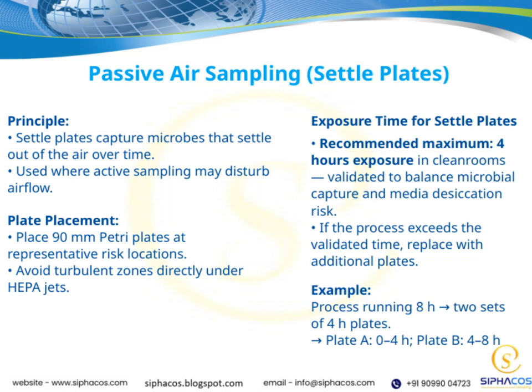Now, moving on to passive air sampling using settle plates. This method relies on the principle that microbes naturally settle out of the air over time. It's especially useful in situations where active sampling might disturb airflow, which could skew results.